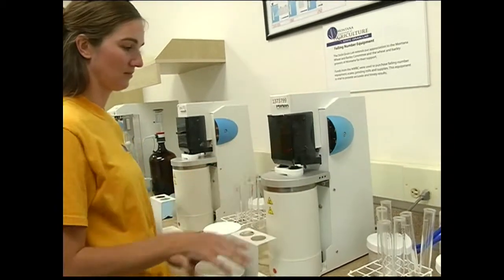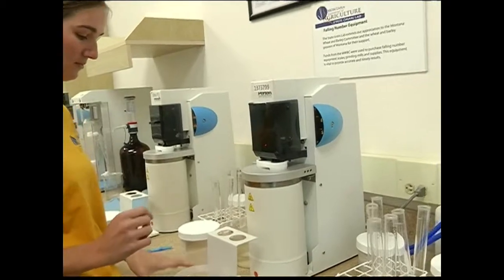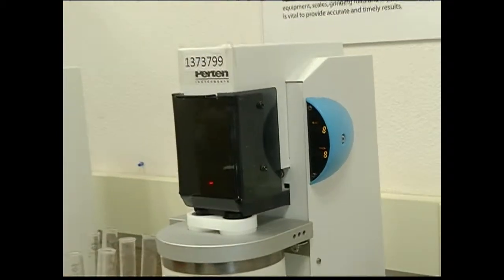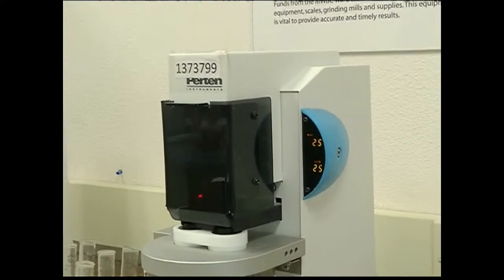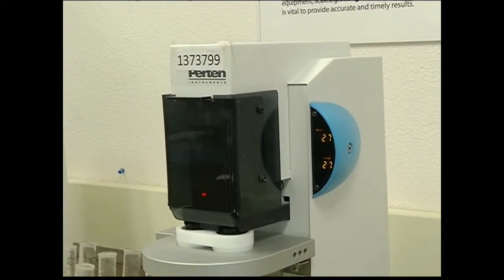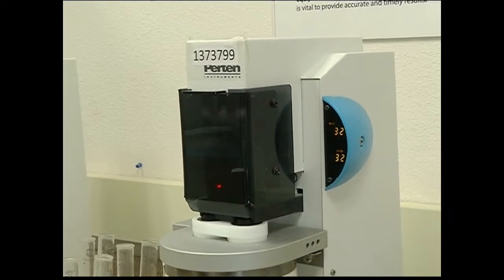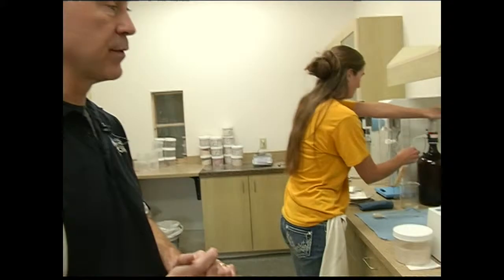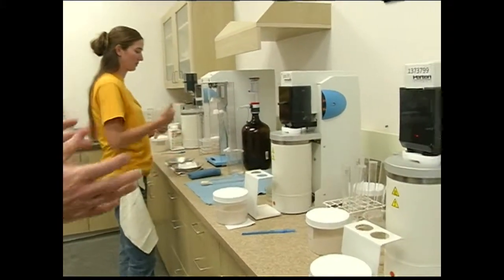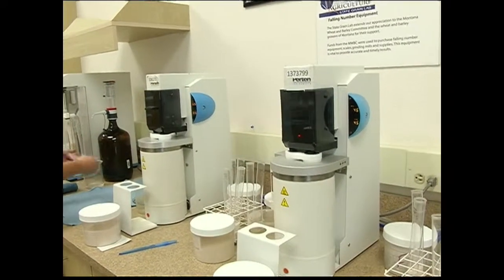So Joey's loading it into the machine. The machine is going to stir that sample and then run the test. Much of our wheat goes into the milling market in Asia, and those markets have a contract rate of 330 falling number points for all the spring wheat that we deliver, or 300 for the winter wheat. So the values that we're looking for here, we hope that they're going to be over that 330 mark.